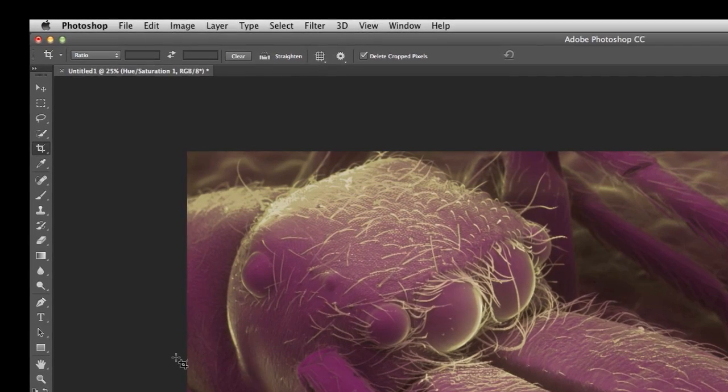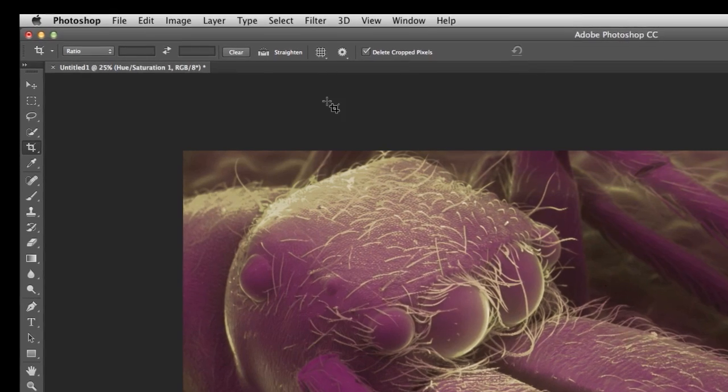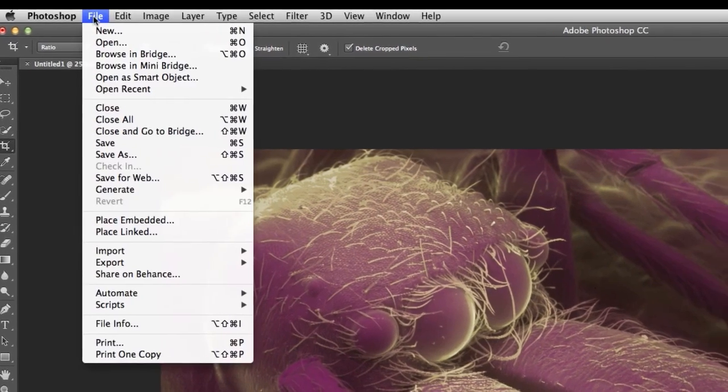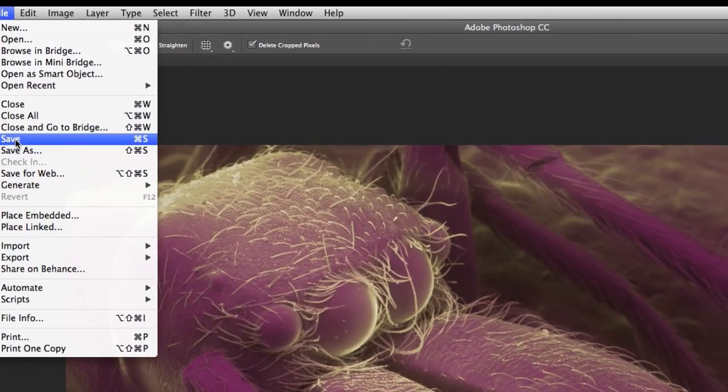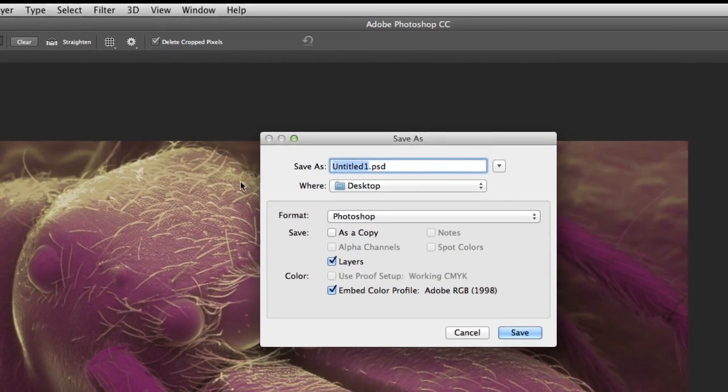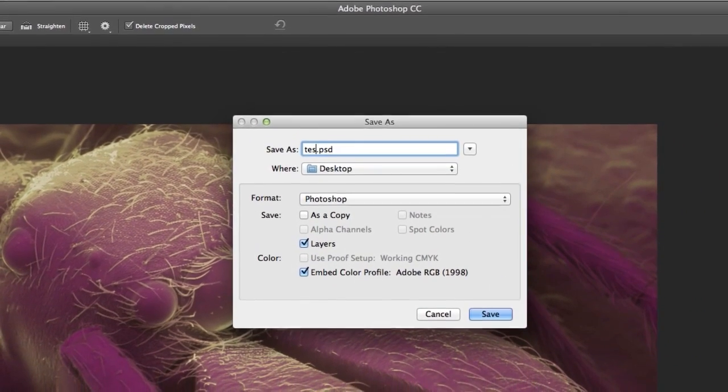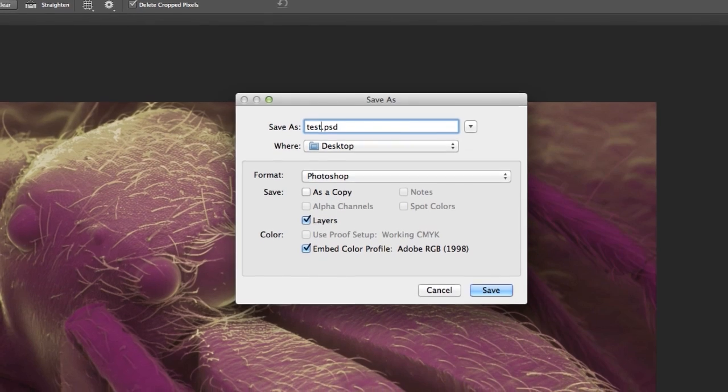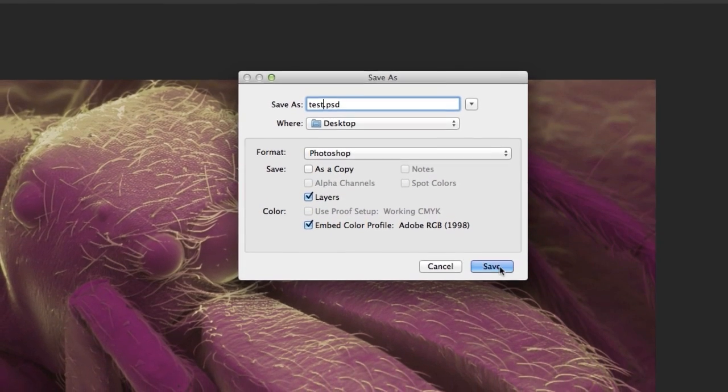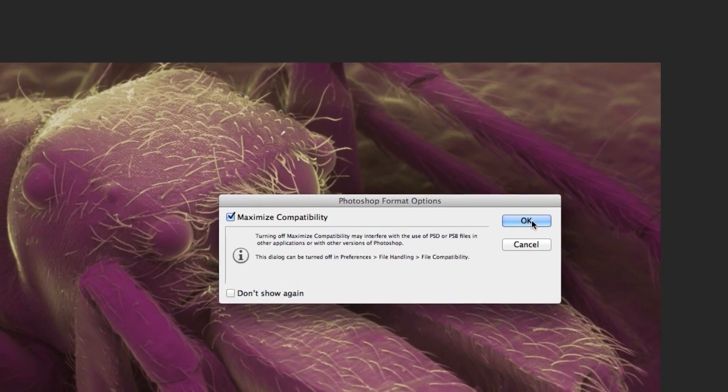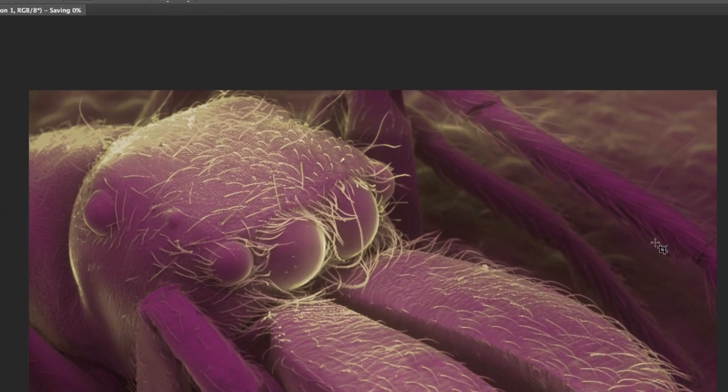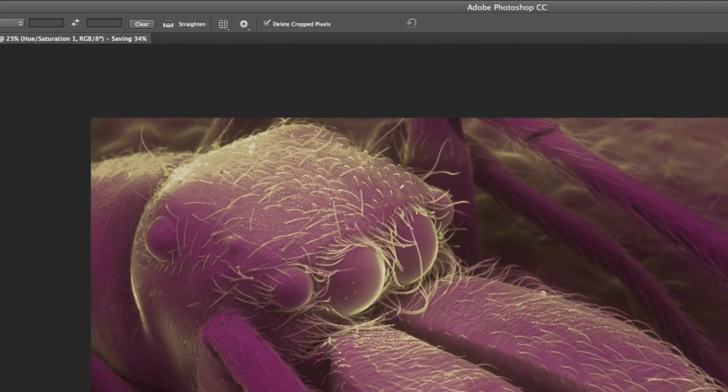And if I'm totally happy with this image, I can save it. I want to come up here to File. And I say Save. And I give it some name, like test for this particular situation. And I'll say Save. And at this point, I can always go back and change all those colors into anything that I possibly want.